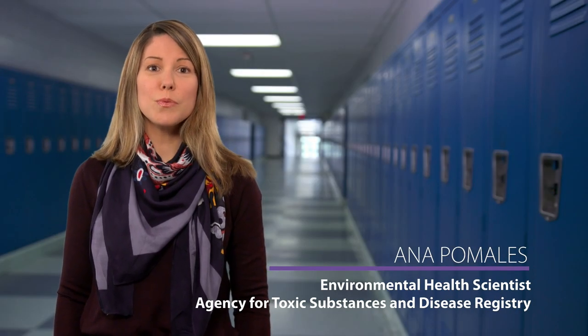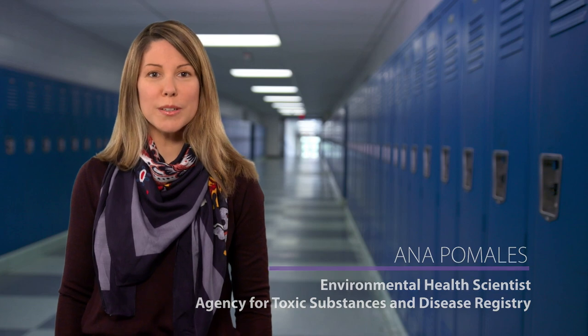Hello! This video will familiarize you with the dangers of elemental mercury. We will provide information on elemental mercury's health effects and how to respond to a mercury spill at your school. We'll help you locate mercury sources in your school, and you will learn about safe, mercury-free alternatives. In addition to this video, ATSDR's Don't Mess with Mercury website is a great resource to learn more about mercury.